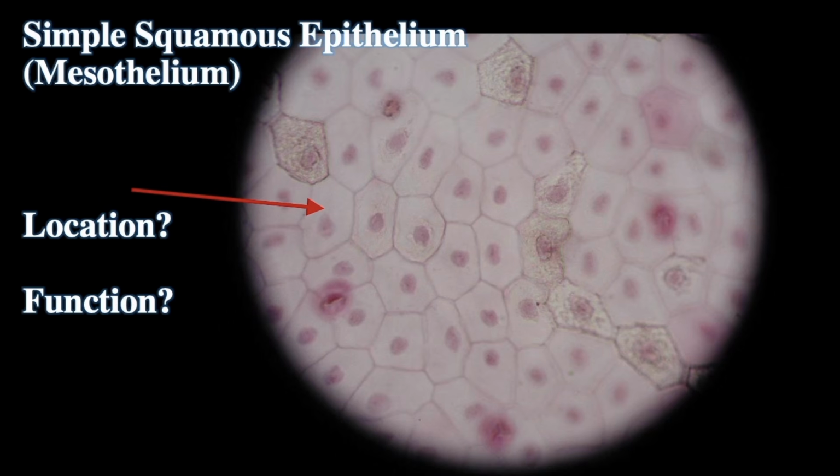This tissue here is called simple squamous epithelium. Why simple? Because every single cell is touching the basement membrane. Now this is a bird's eye view. This is the only tissue where we'll actually see this view. Maybe there might be one more view, but pretty much this is the only tissue where we have the view like this. Why? Because they're so squashed, so squamous, so thin that it'd be hard to see it from the cross-sectional view. So we show it from a bird's eye view.